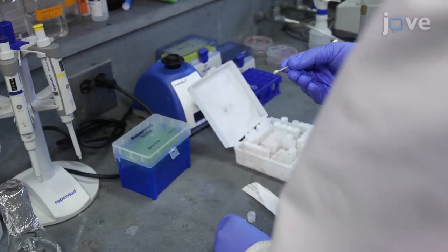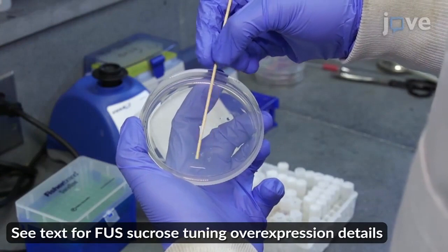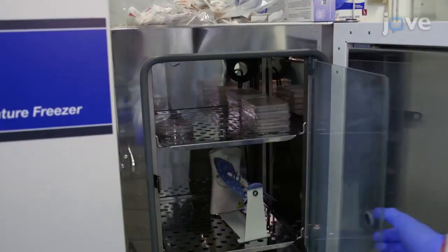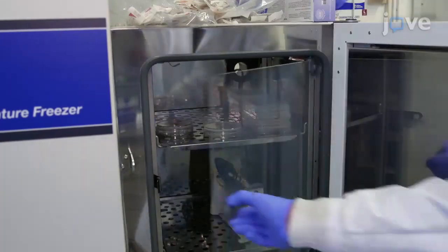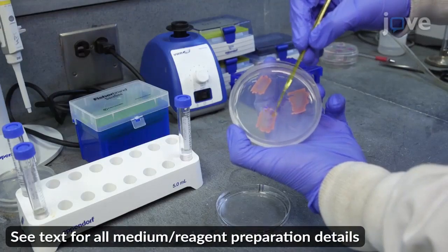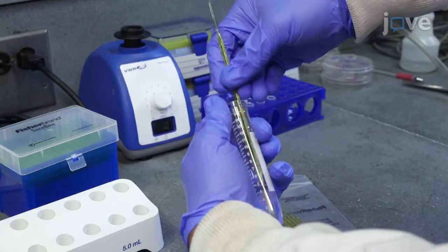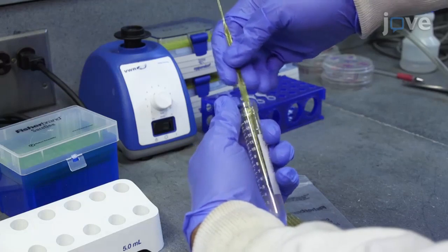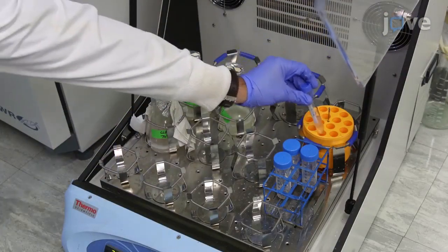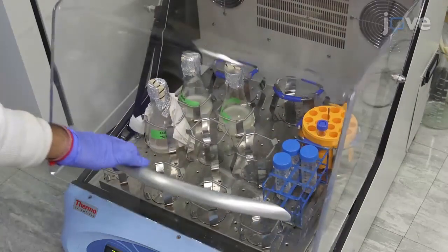Begin by re-streaking yeast from frozen glycerol stocks onto histidine-lacking 2% glucose agar selective medium plates for a 2 to 3 day incubation at 30 degrees Celsius. At the end of the incubation, inoculate re-streaked yeast for each overexpression model and control in 5 milliliters of histidine-lacking selective liquid medium, supplemented with 2% raffinose at 30 degrees Celsius and 200 rotations per minute overnight.